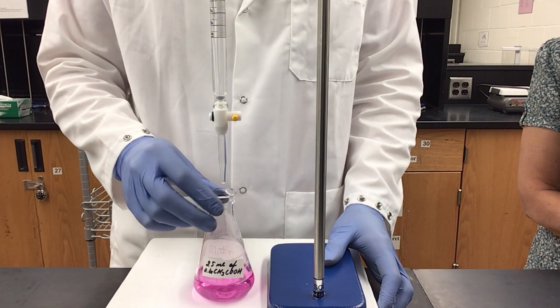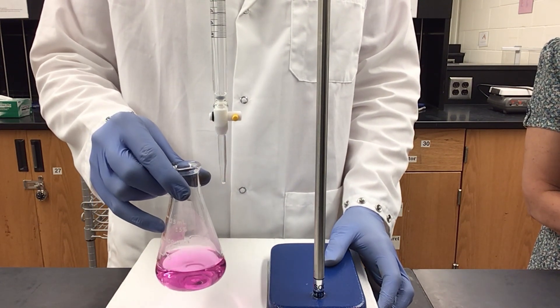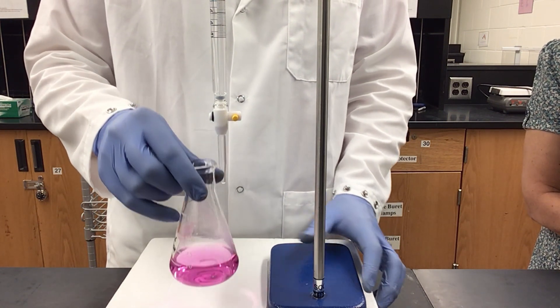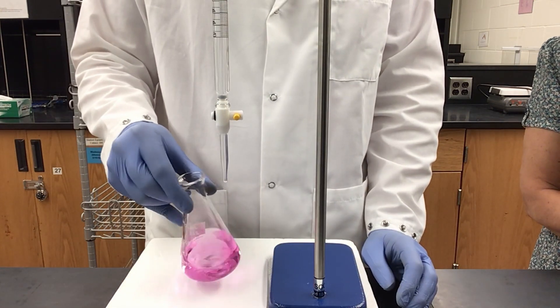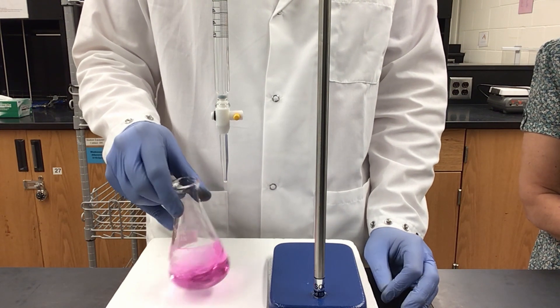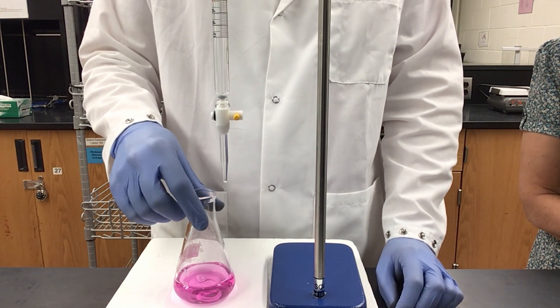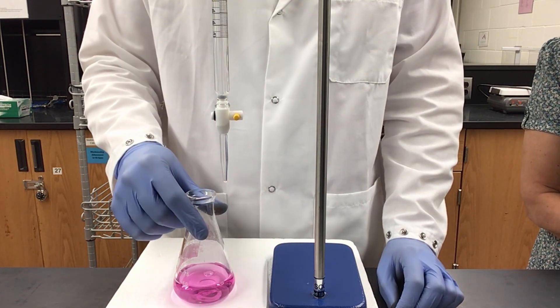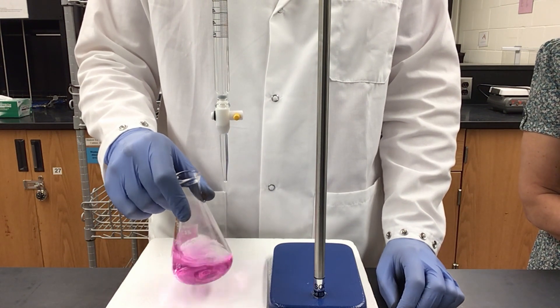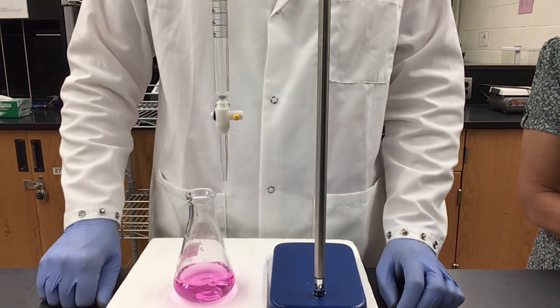I have taken the flask I just titrated and added one more drop of sodium hydroxide. As you can see, it is now a very deep pink color and is not going away when I swirl, which means by adding just that single drop I have over-titrated the solution and exceeded my endpoint. Phenolphthalein is an indicator that you need to titrate with very carefully in order to make sure you do not over-titrate your solution.